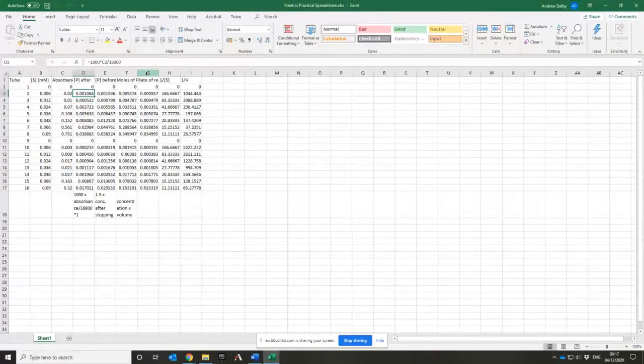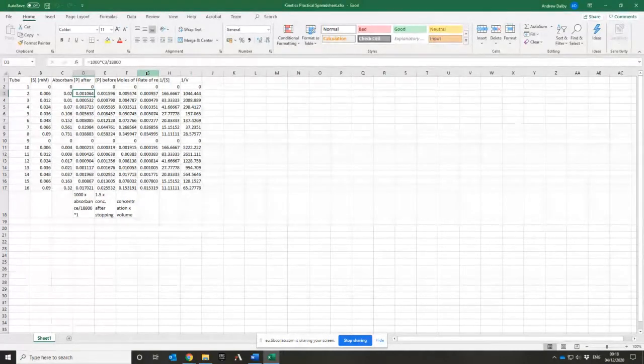It has to have an x squared term, as well as an x term, which is part of your line, and a constant, just a regular number. So that means I now need three numbers to define it: ax squared plus bx plus c. So I've gone from two numbers for a line to three for a quadratic.